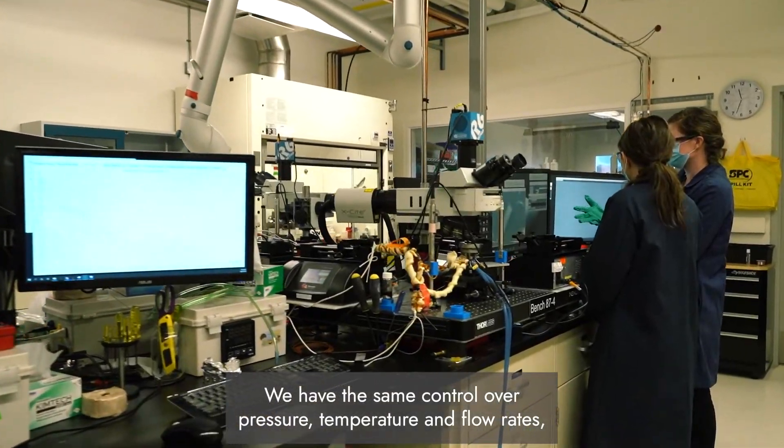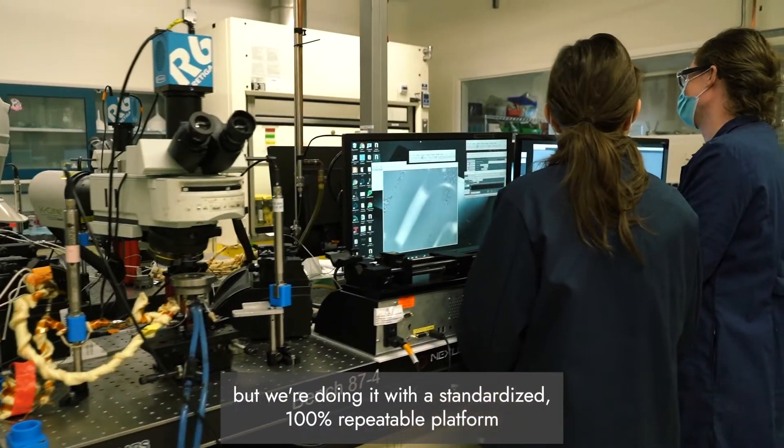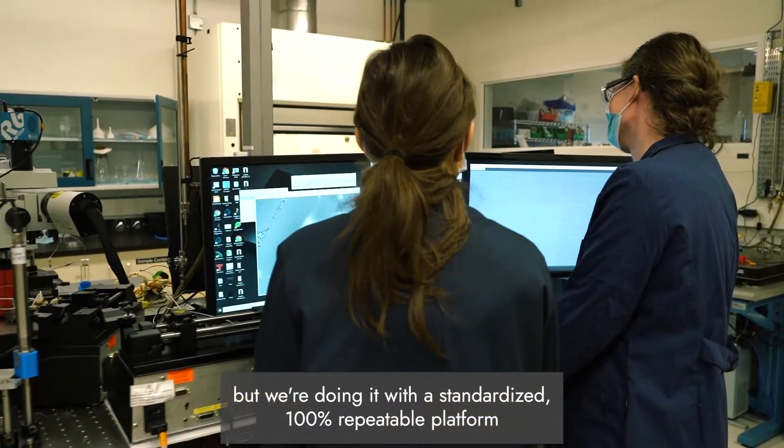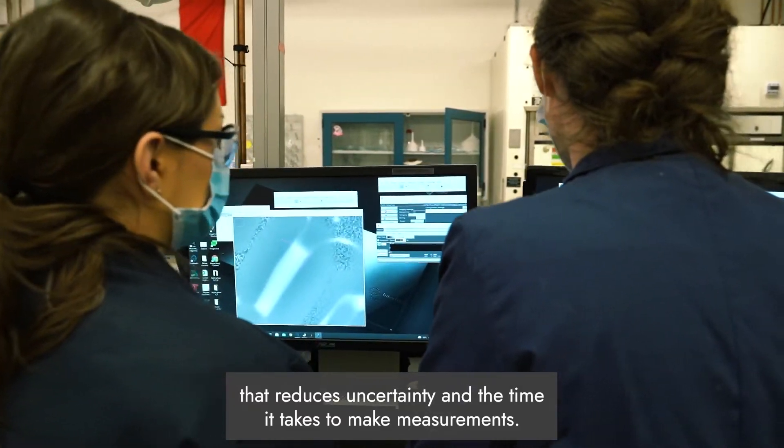We have the same control over pressure, temperature, and flow rates, but we're doing it with a standardized, 100% repeatable platform that reduces uncertainty and the time it takes to make measurements.